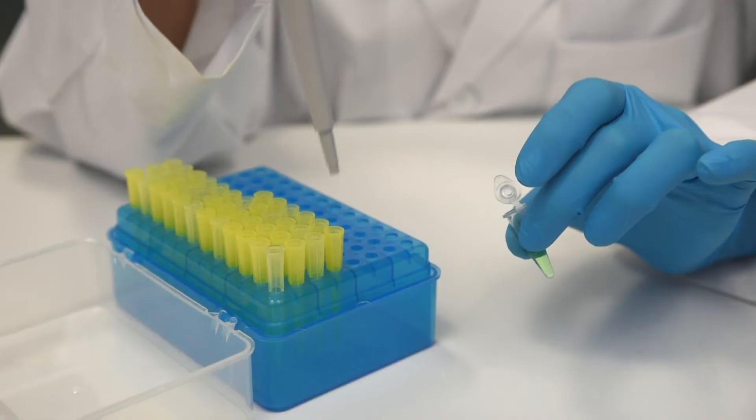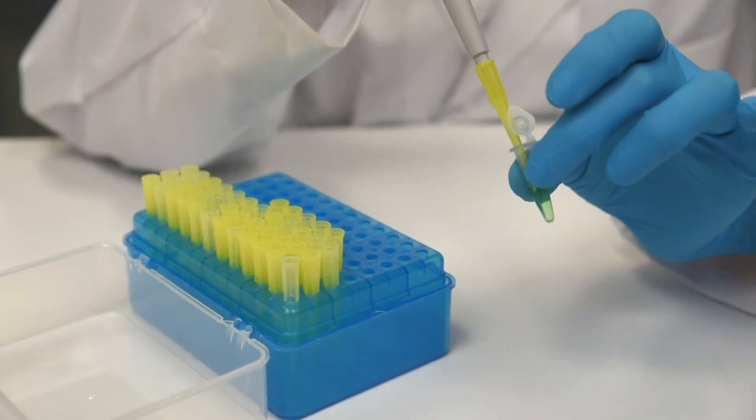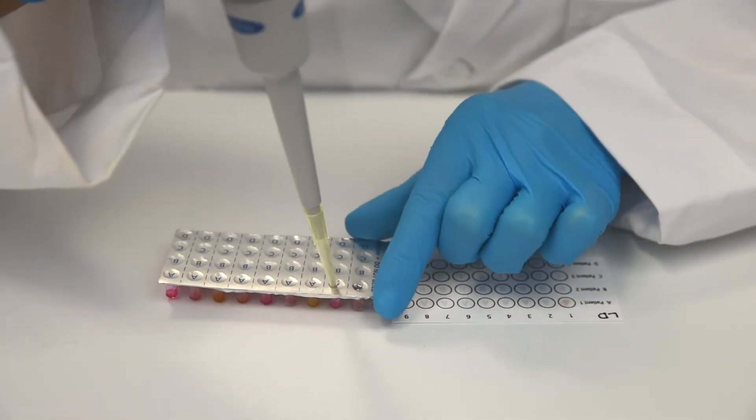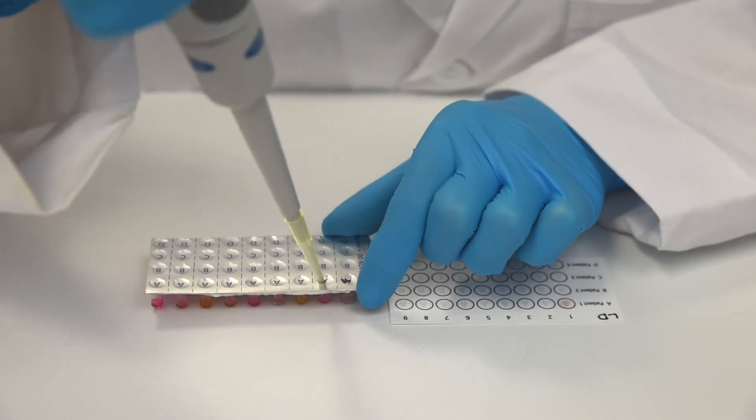Step 7. Using a fresh micropipette tip, repeat steps 4 through 6 for the second sample on the top row.